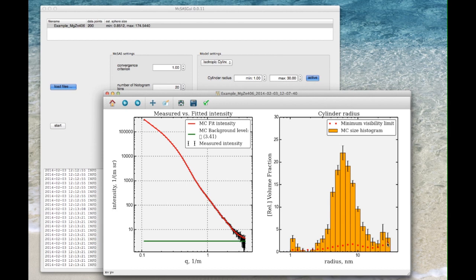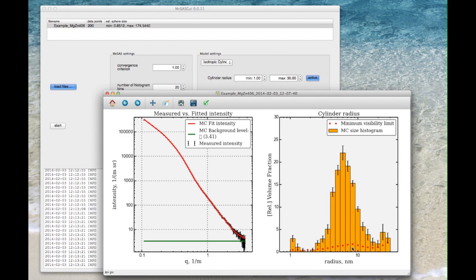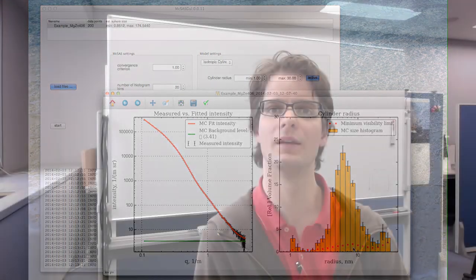This red dotted line is the minimum observability line. You need at least this contribution for this bar for it to make a significant impact on the scattering pattern.